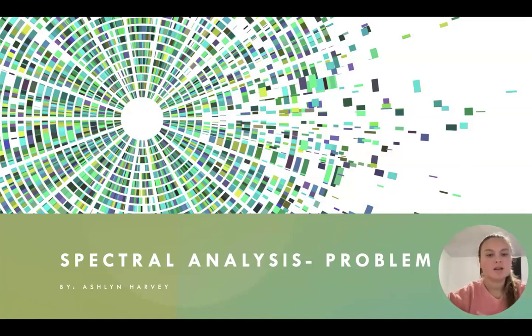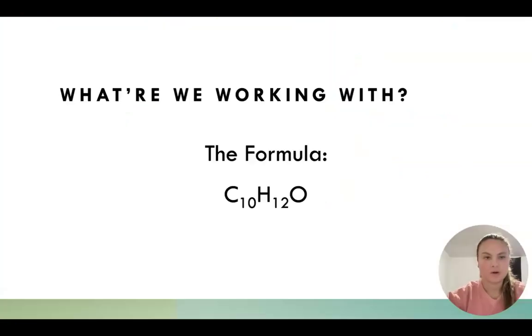To begin, let's talk about what we're working with. The formula that I was given for my problem is C10H12O.